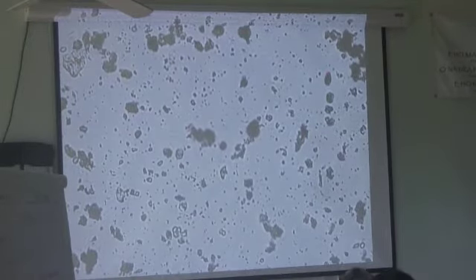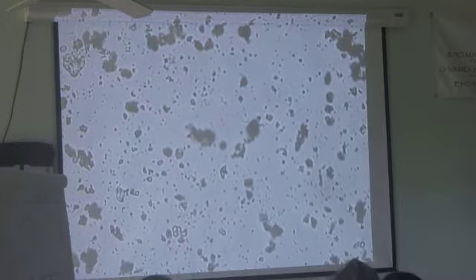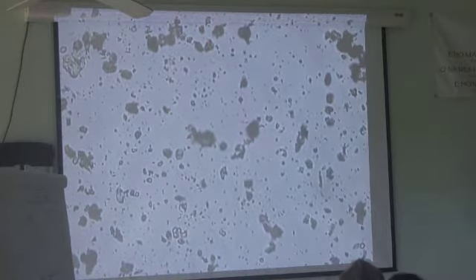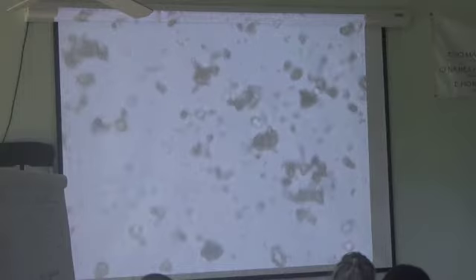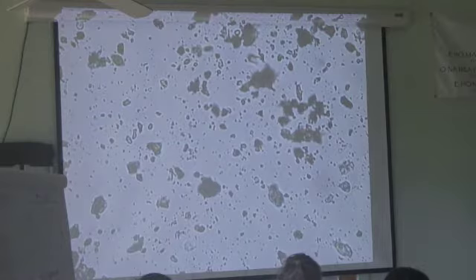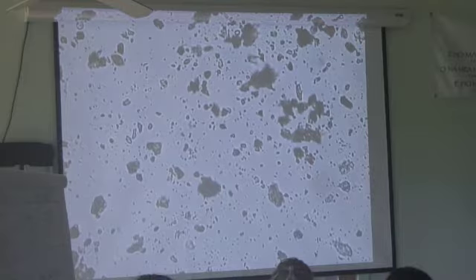Whoop, there went a slit. Yeah, fast, and they're kind of hard to catch when you're at this high magnification. It was nice, smooth movement. It wasn't bumbling at all. So most likely a ciliate. Nice to capture him in. Where'd he go? There he is. Let's see, can I focus on him fast enough? Yeah, they were so fast. So I would suspect that that's a ciliate, and I would probably record that. Two ciliates in this field of view because they were zooming by. If we wait long enough, they'll come back.